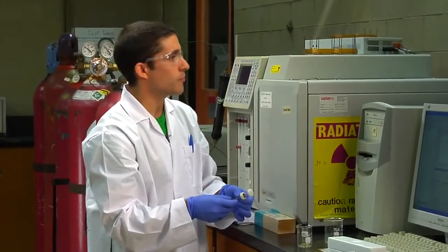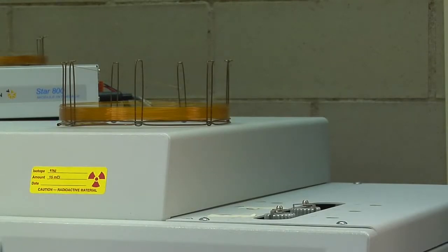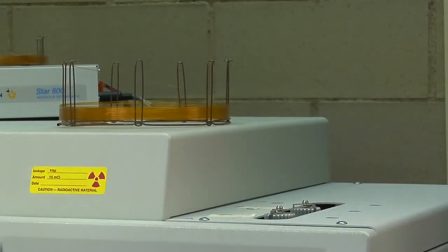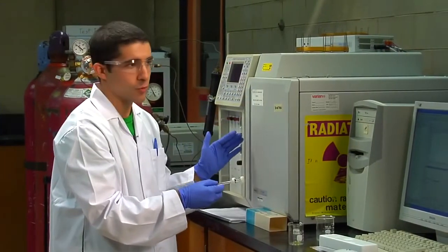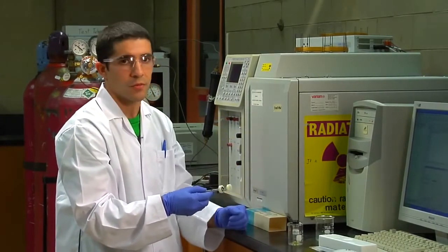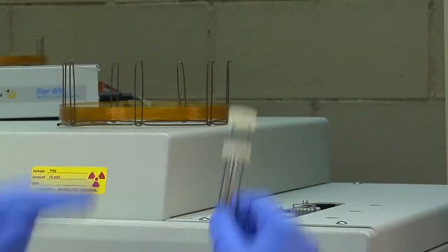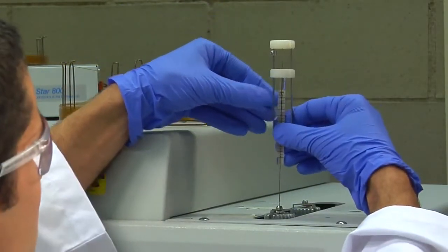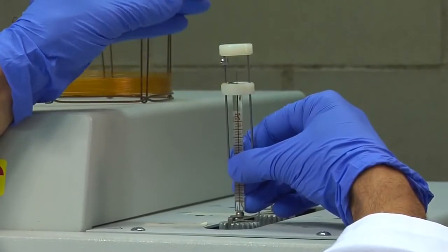To perform your injection, you'll use the sample injector port that's closest to you. It's labeled the FID detector, so make sure you use that port. Now what you'll see is a little piece of metal that's sticking out. It's kind of like a button or a trigger, where when you push down on that button, it starts the injection process on the chromatograph, and it also sends a signal to the system saying that you can now perform the integration. So you'll first pierce the rubber septum, and then when I push down on the button, I'll inject the sample.